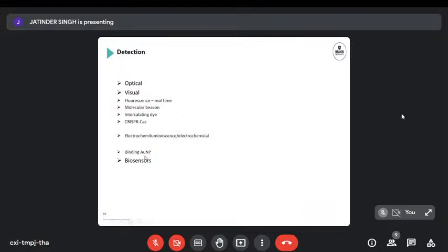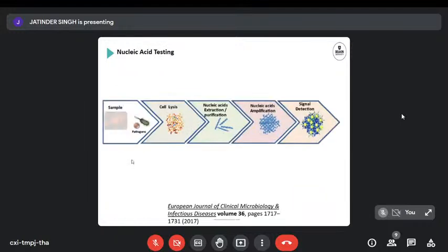Electrochemical detection is also an option. As I said, lateral flow chips. And there are particular DNA-sensitive biosensors as well that can be used either in conjunction with an amplification, or amplification can be skipped all the way, particularly if the DNA levels are relatively high. So we can put all that together in a device, and we've already been through a few. I thought we would close this lecture with one example of how that can be put together into a microfluidic device.